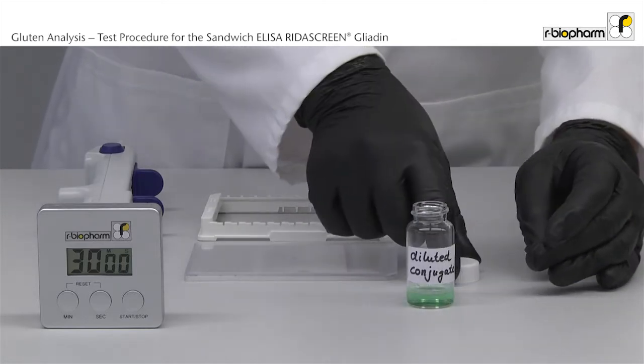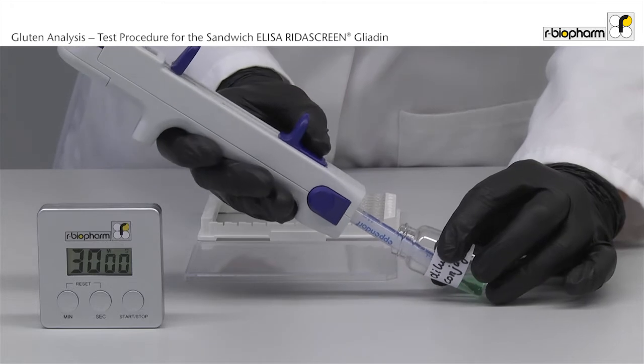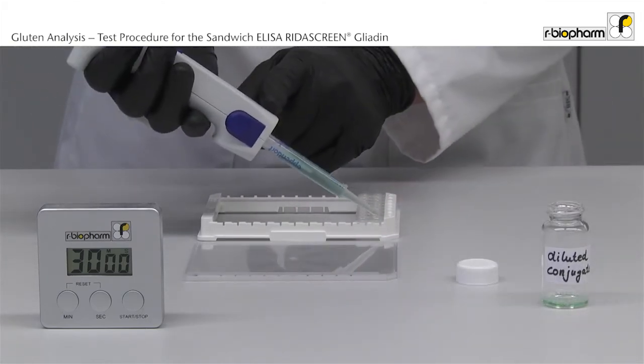Pipette 100 µl diluted conjugate using a stepper. Flush the pipette tip several times and avoid bubbles. Discard the first aliquot before pipetting the ELISA. Avoid splashing.